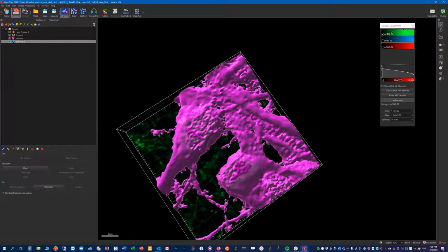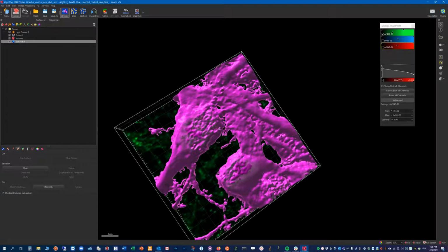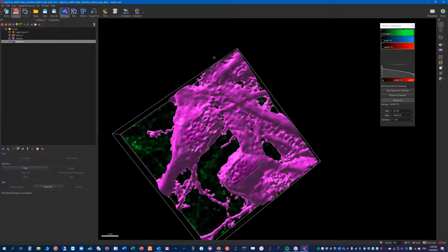To do that, I have to position myself vertically, because there is only one cut line that will be drawn. Let me show you. If you Shift-click on the object, you see the blue line is the line that will cut my object. So let's position it here. Everything along this blue line will be cut. Obviously there will be parts that we do not want to be cut, but this doesn't matter at the moment because we can correct this afterwards.